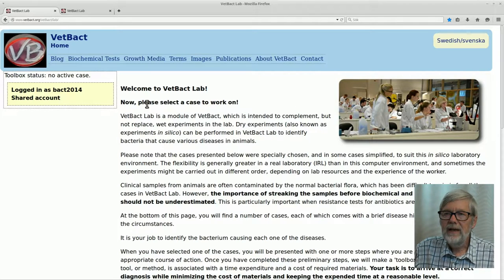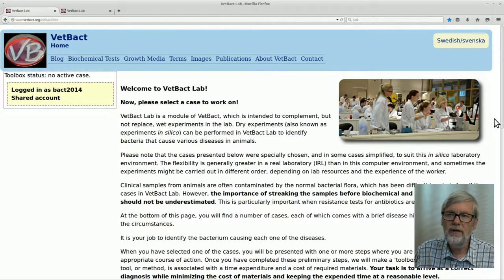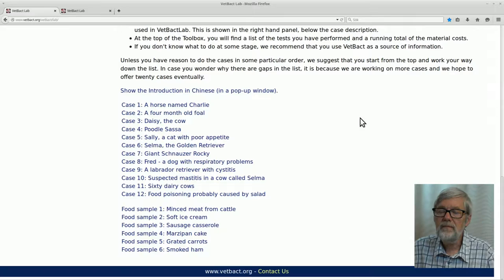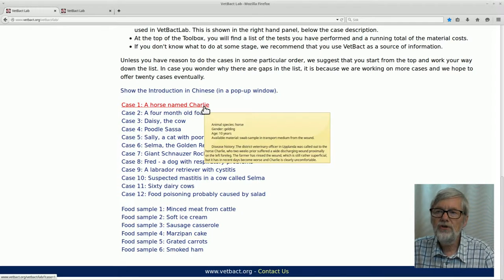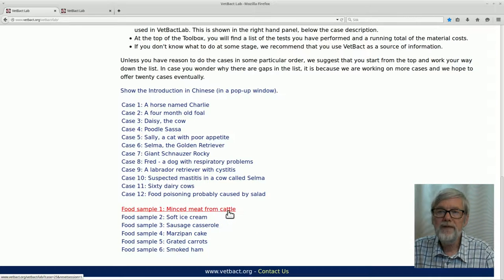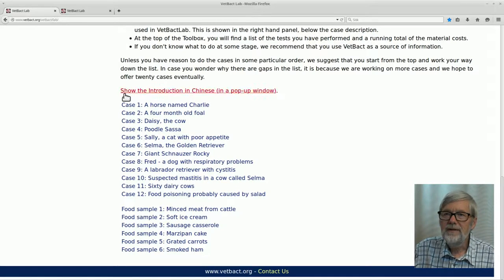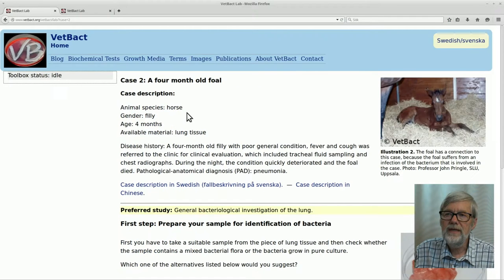Here on the start page for VETPACT lab you can have information about how you should proceed with the different experiments you can do here. But I cannot go through everything here because it is rather much, so this you should read yourself when you start an experiment. You have 12 different cases in diagnostic veterinary bacteriology and 6 food samples which you can also analyze. For students who speak Chinese there is some information also for them. I will select case number 2 and go through it so you can see how you should proceed.